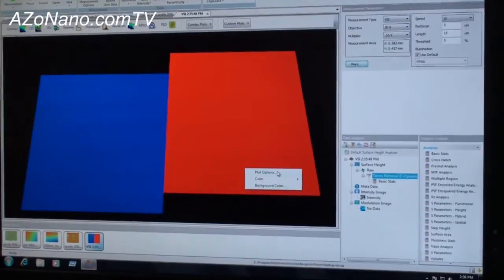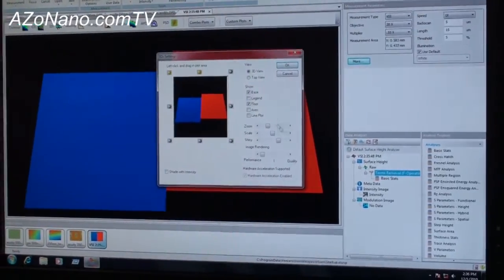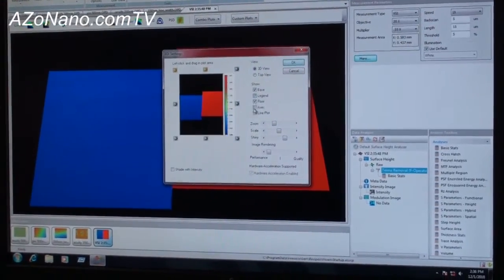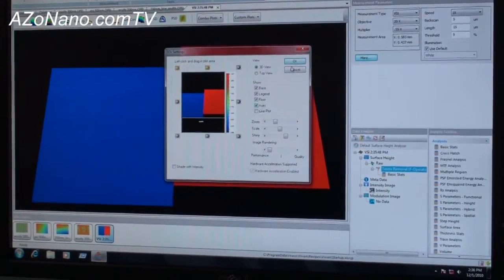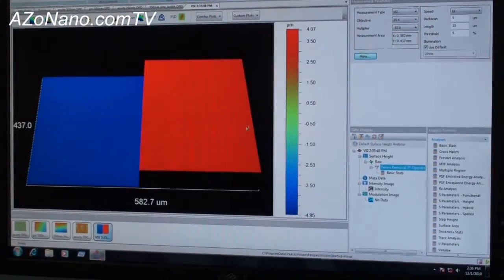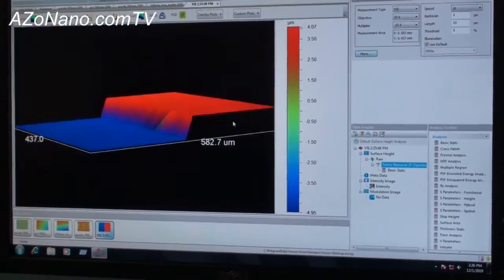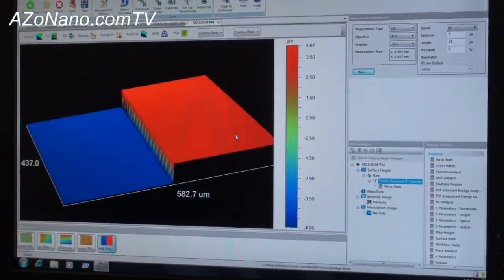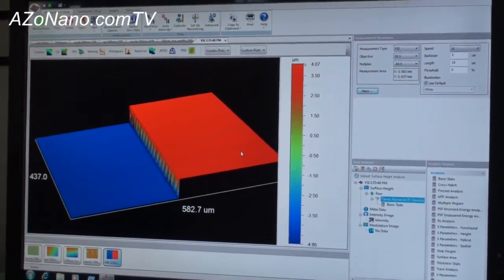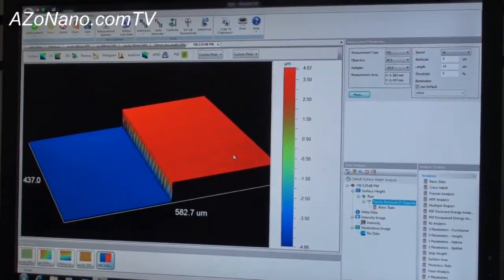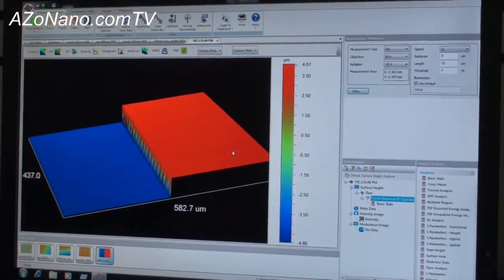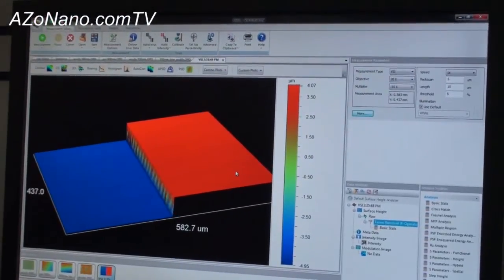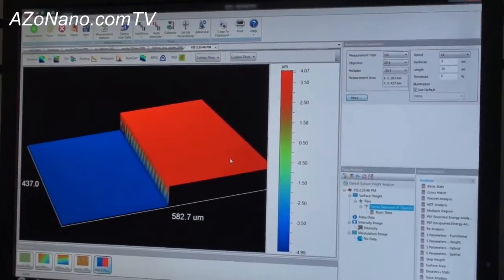Let me make this a little nicer with the legend and some axes. So there's our measurement. It takes a few seconds. Get a very nice looking image here but also really good quality data out of it and a very quick measurement.